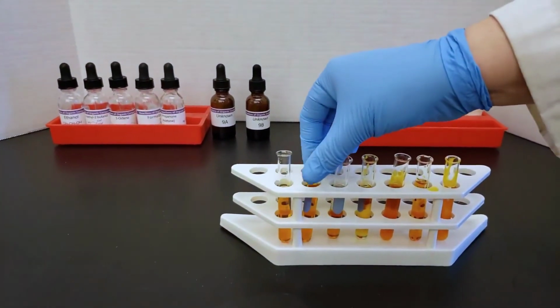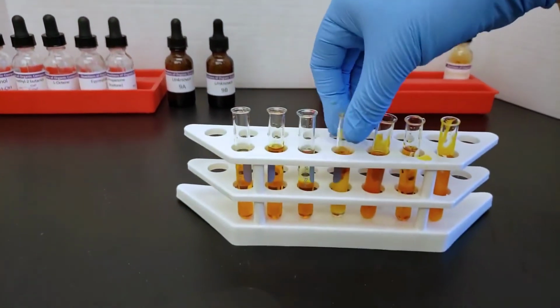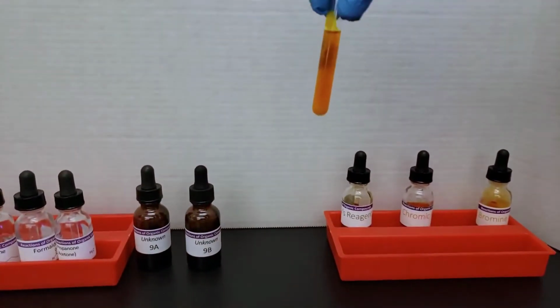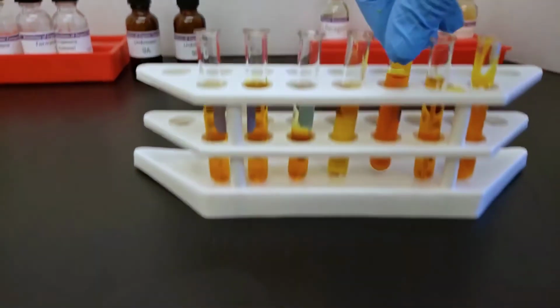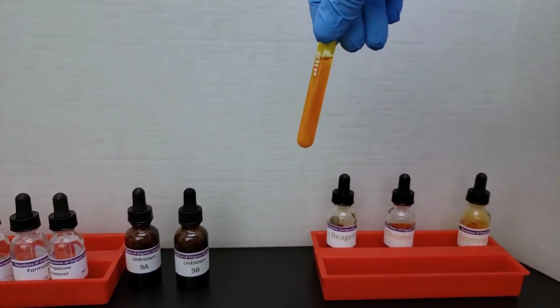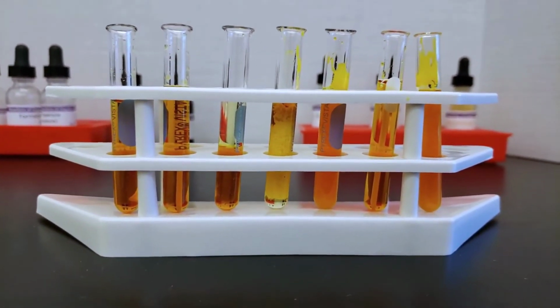Here we are just double checking, no precipitate in tube 1, no precipitate in tube 2 or 3. We already know tube 3 is pretty much an alkene, so there's going to be no reaction. And we get a small amount of precipitate in the acetone tube and a very obvious amount in the formaldehyde tube. No precipitate in unknown A, and this one looks pretty similar to one of the other tubes. There's a final look at everything, so we can pretty much identify unknown 9B now.